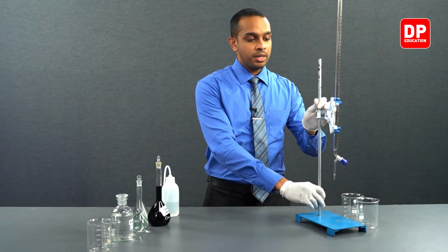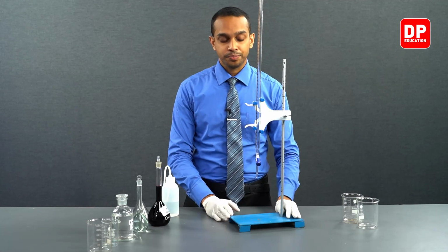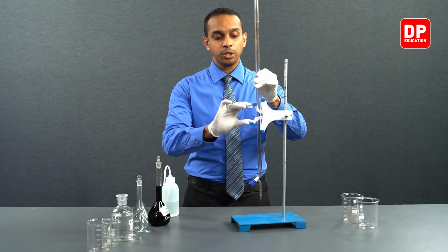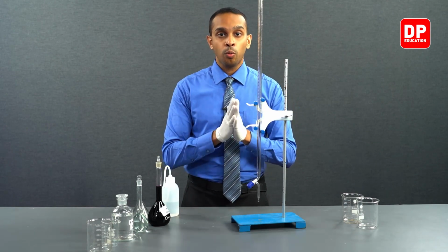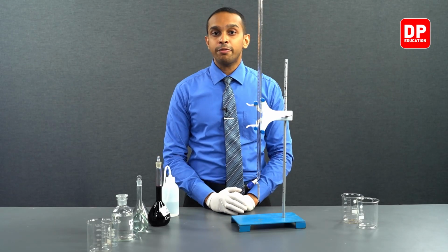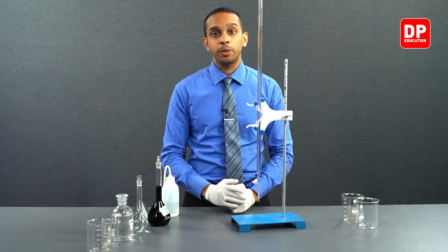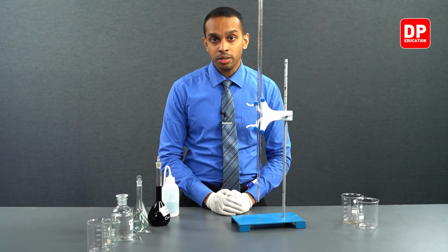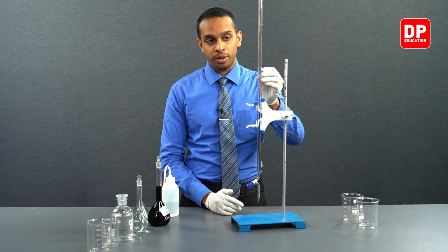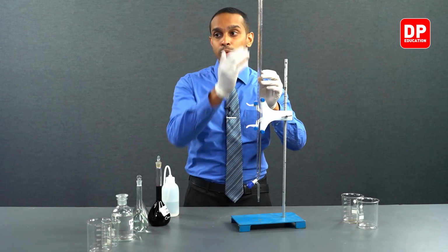So what we have here is a burette connected to its retort stand, and before we use this burette, we have to make sure that it is washed with distilled water, and then we have to wash it again with the solution that you're going to fill into the burette. This is to make sure that the droplets of water remaining inside the burette do not dilute the solution that is being added to the burette.